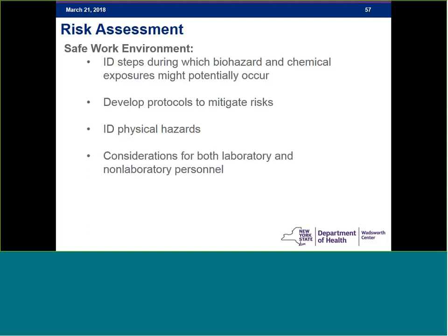It is important to have knowledge of who's in the lab as far as non-laboratory personnel, as this has often complicated Brucella exposure investigations. This could include janitors, students, and instrument service technicians that could all be potentially exposed if a highly infectious agent is isolated in the laboratory in their presence.